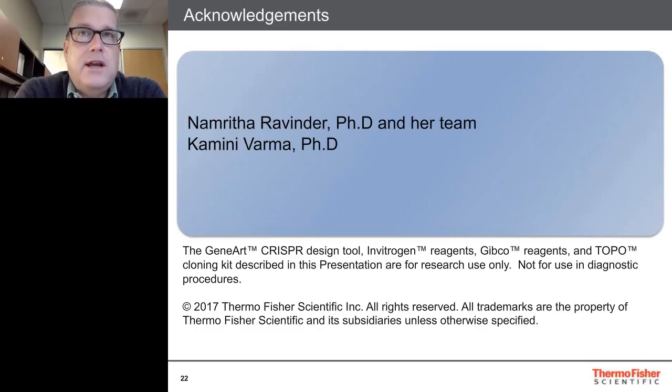There are Sanger sequencing methods. There's next generation sequencing methods. And in some cases, TaqMan might be useful as well. So again, I want to emphasize there isn't one right answer. There are a lot of different ways that you can get at the efficiency calculations. But of course, given how important efficiency calculations are in dictating how you go about the next steps of your experiment, it really is important to determine what your efficiency is before proceeding.